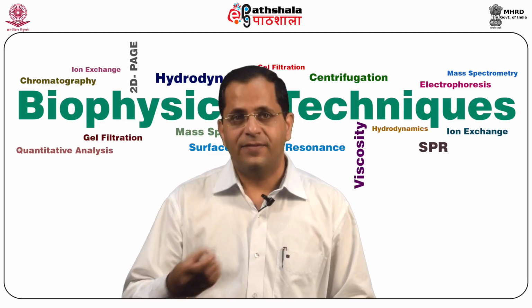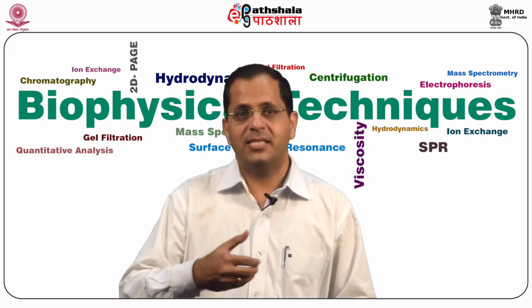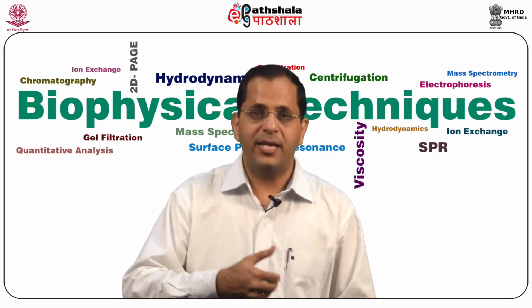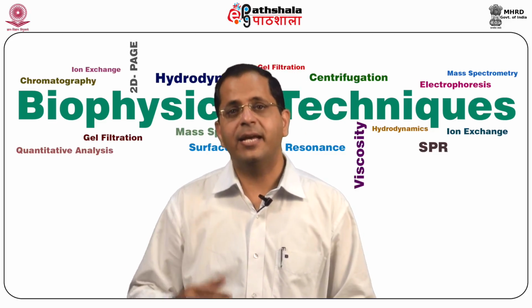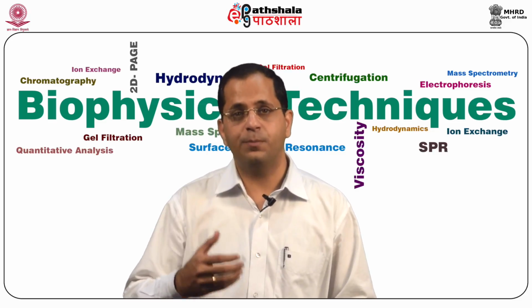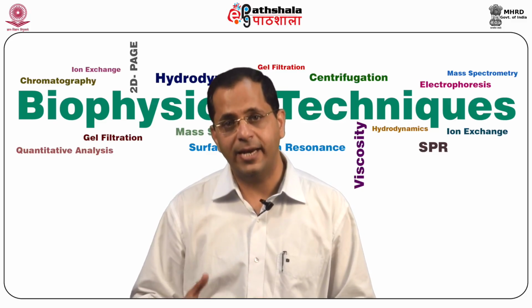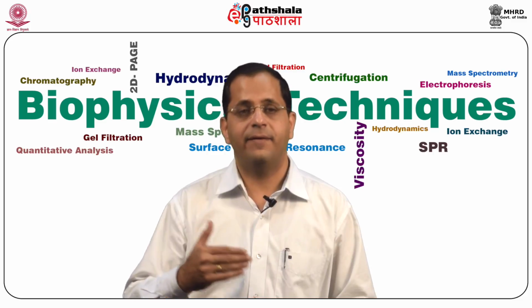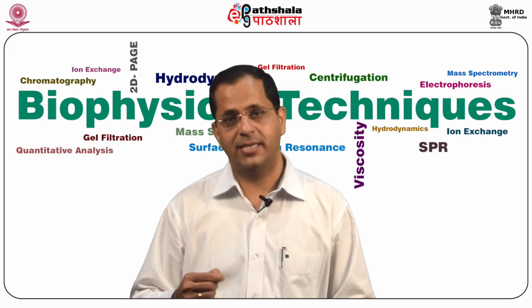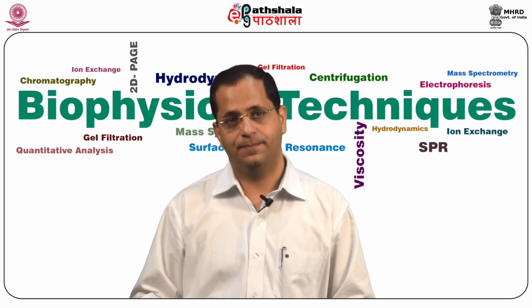This is the DIGE, where there is a standard for every spot on the gel and all gels within the same experiment are quantitatively linked. The gel-to-gel variations are eliminated, making technical replicates optional. The internal standard is used to match and normalize the protein patterns across different gels, thereby negating the problem of inter-gel variation. Accurate quantification and accurate spot statistics between the gels can also be obtained for these experiments.